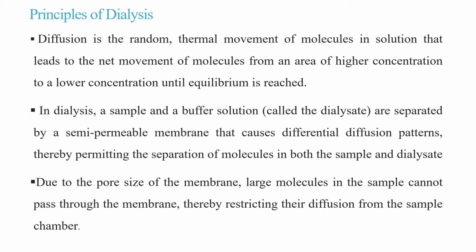In dialysis, a sample and a buffer solution are separated by a semi-permeable membrane, which causes a differential diffusion pattern and thereby permits the separation of the molecules in the sample and the dialysate. The buffer solution is known as the dialysate.